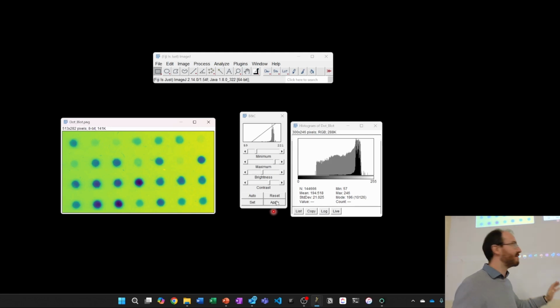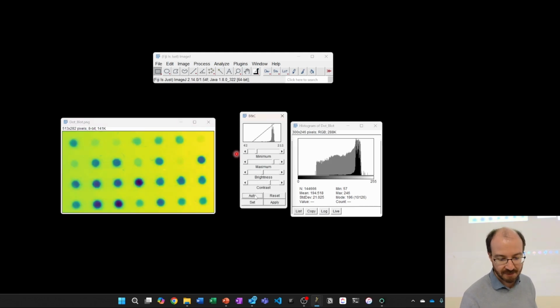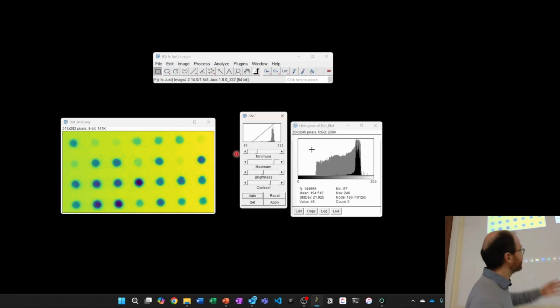For visualization, please change these values as much as you want. Maybe just to show you another quick trick here, if I click on this auto button, it then tries to automatically find the optimal values. You can see that the values it found automatically are 62 and 212. And if I relate it to the histogram, it is 60, which I found, and it's maybe saturating a little bit more, but it's just automatically determining where the optimal places are.